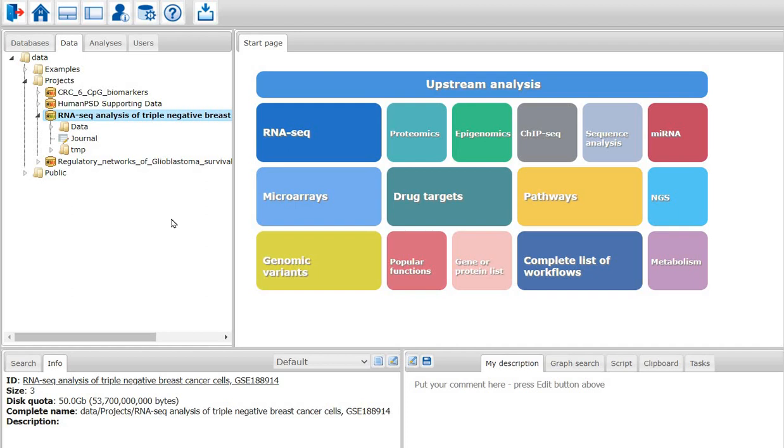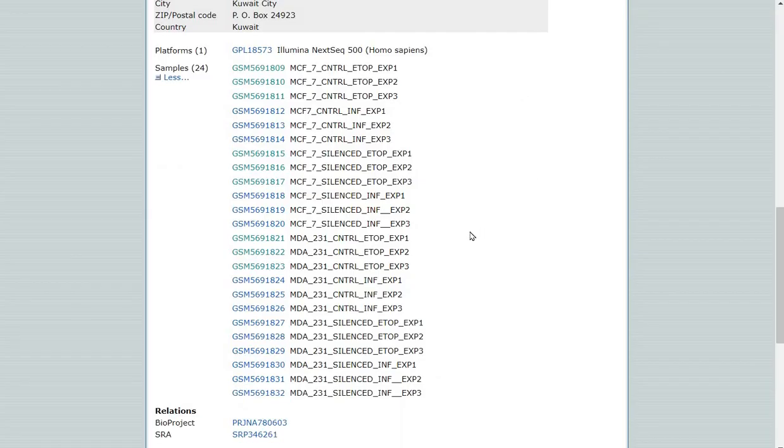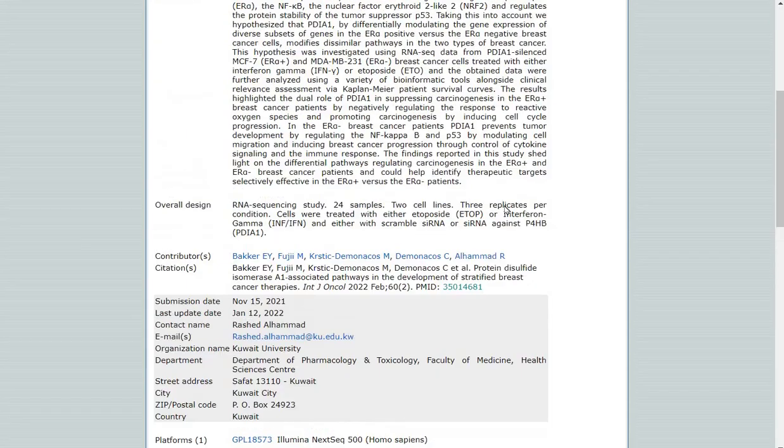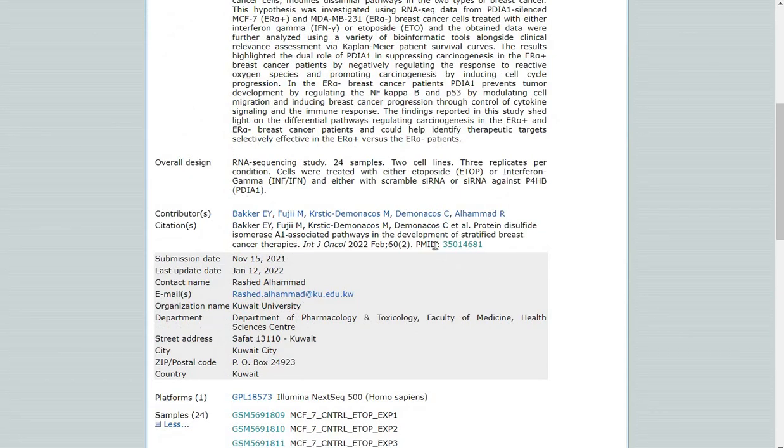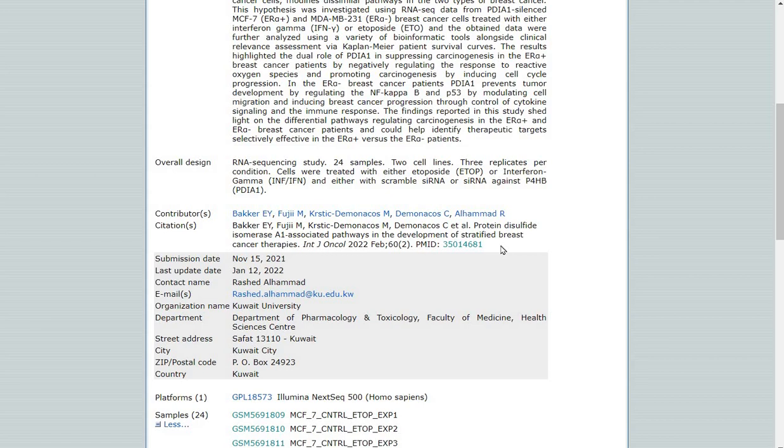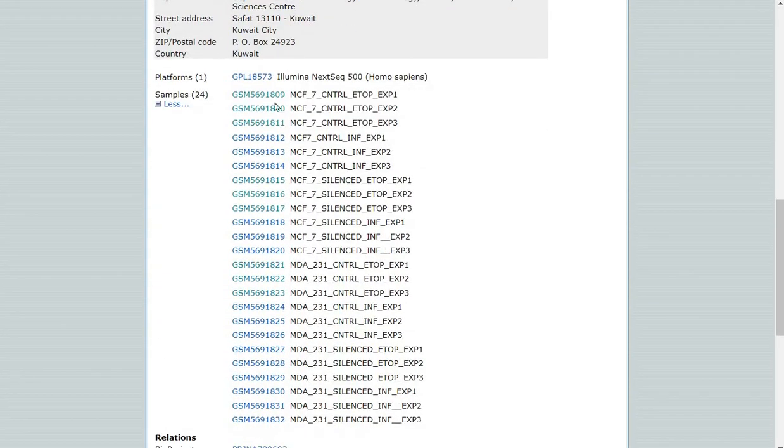Hello everyone. Today I am starting RNA-seq data analysis using the GeneXplain platform. My interest is to analyze transcriptomics data in breast cancer triple negative cells. For this task, I have selected RNA-seq FASTAQ files from Gene Expression Omnibus GSE188914. This is a publicly available dataset, and my focus is to compare gene expression between MDA231 cell line, which is a triple negative breast cancer cell line, with MCF7, which is an estrogen receptor positive cell line.